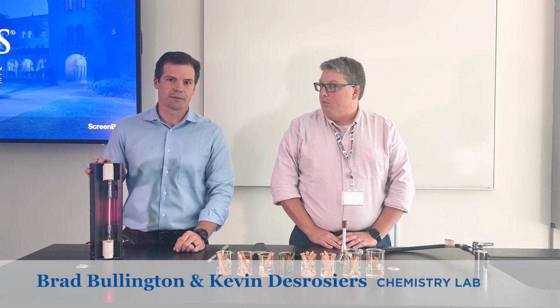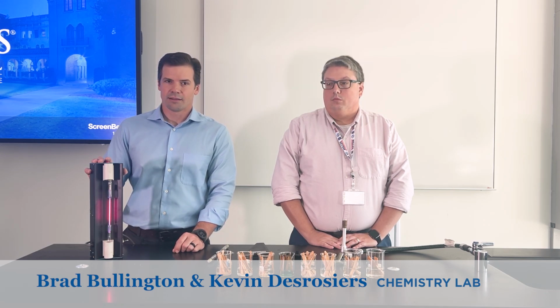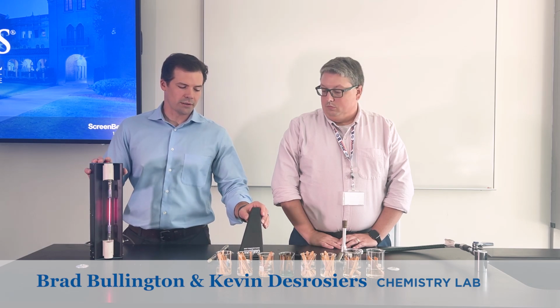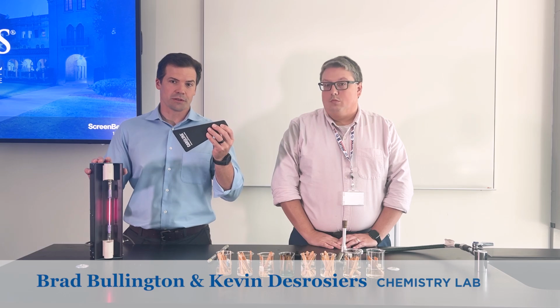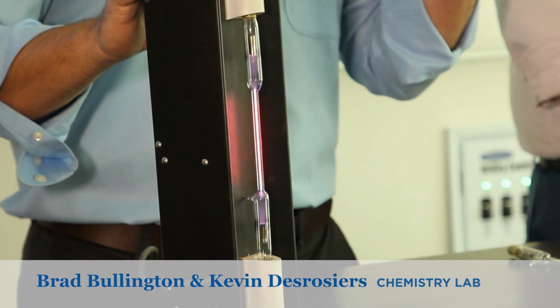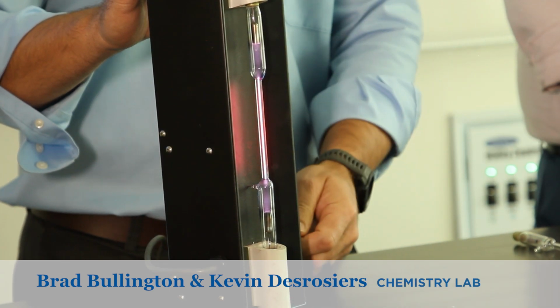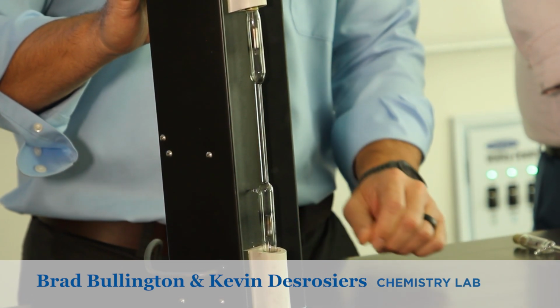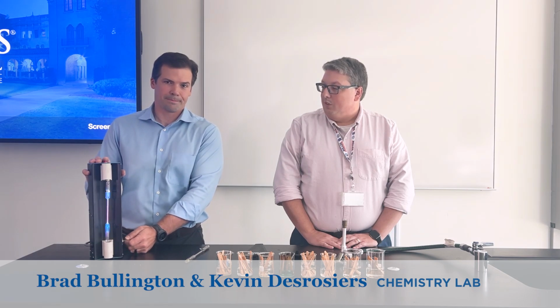Here we have hydrogen. Hydrogen gives off a bright line spectrum, as you can see. And these bright lines are analyzed by the students with the spectroscope. And they correspond to the position of the electrons around the atom. Kevin's going to tell you about the next gas that we have, mercury.